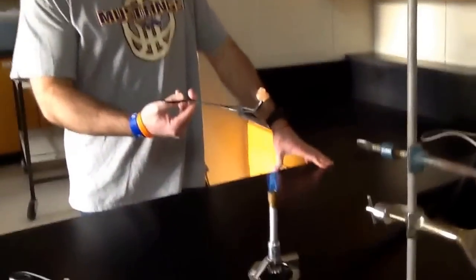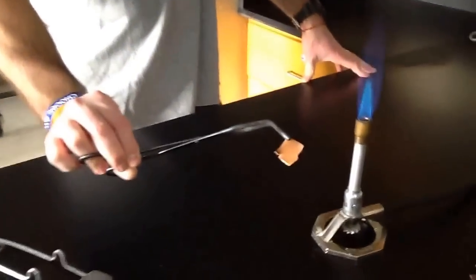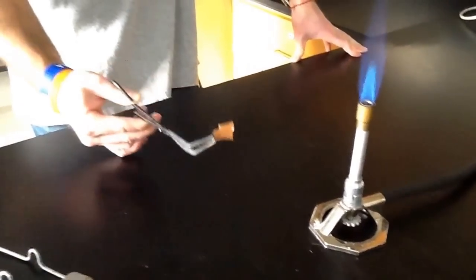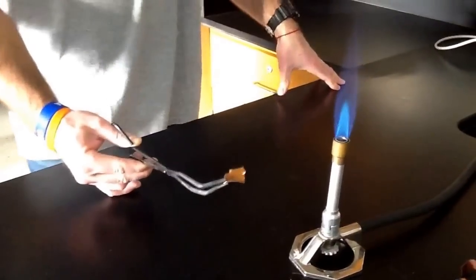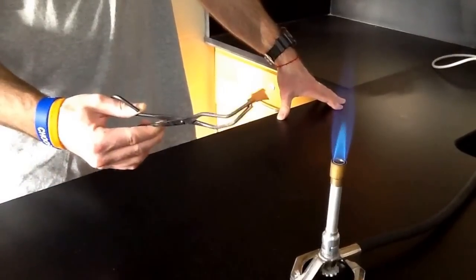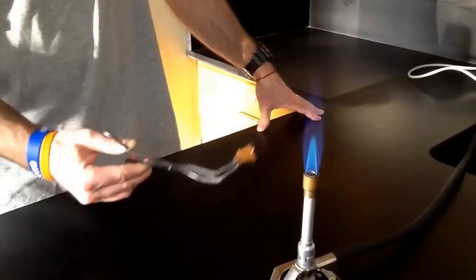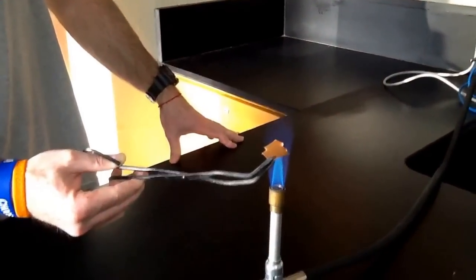We're going to take some copper metal, and so you can see copper is kind of a nice goldish brown color. And what we're going to do is heat it in the presence of oxygen. On the surface of things, it might seem like we're just heating up the metal, so we just have maybe one reactant. But in this case, the other reactant is oxygen, which is in the air. All right. So here we go. Start heating this up.